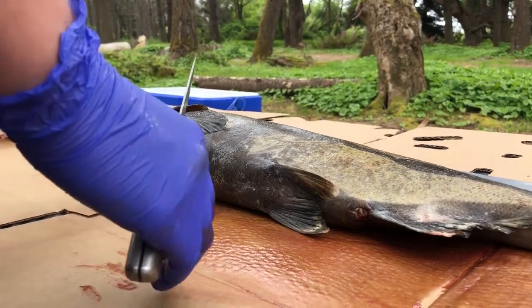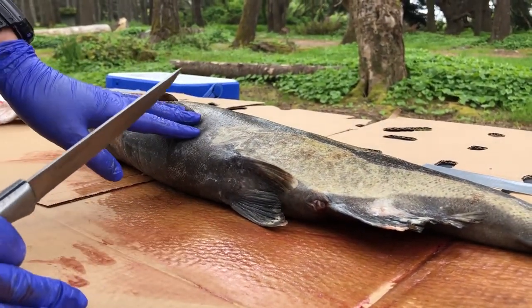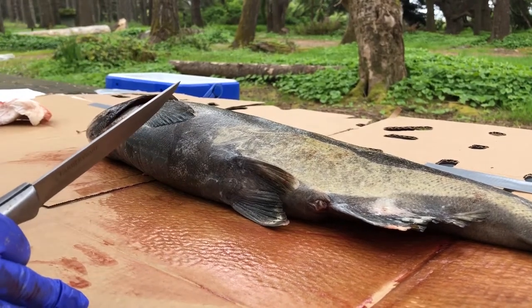We already talked about the external anatomy of the fish, so now I'm going to dissect this fish and we're going to talk about the internal anatomy.